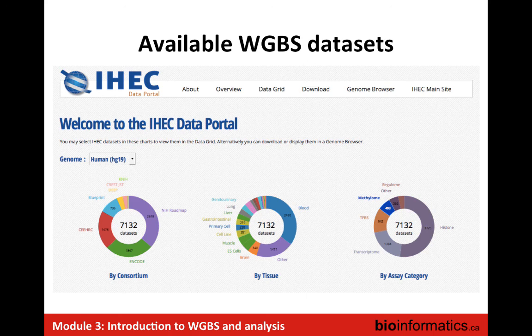Another challenge, which I didn't mention at all, is that especially with whole genome bisulfite sequencing, the processing is quite intensive because you have all these extra steps of converting all your reads into these other reads, mapping multiple times, getting four alignments and then pulling them all together. So we're going to do a mini version that's restricted to some regions of the genome. Doing it with the full 30x data set is computationally very intensive because you're doing it multiple times. But with that, I'll take a few questions, if you have any.